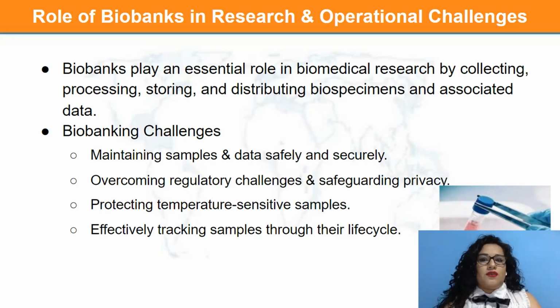Another major challenge for biobanks is that the biological samples are, in most cases, temperature sensitive and may be affected by environmental changes, like humidity, light, or oxygen levels. So biobanks must build infrastructure and deploy monitoring systems to maintain sample quality.